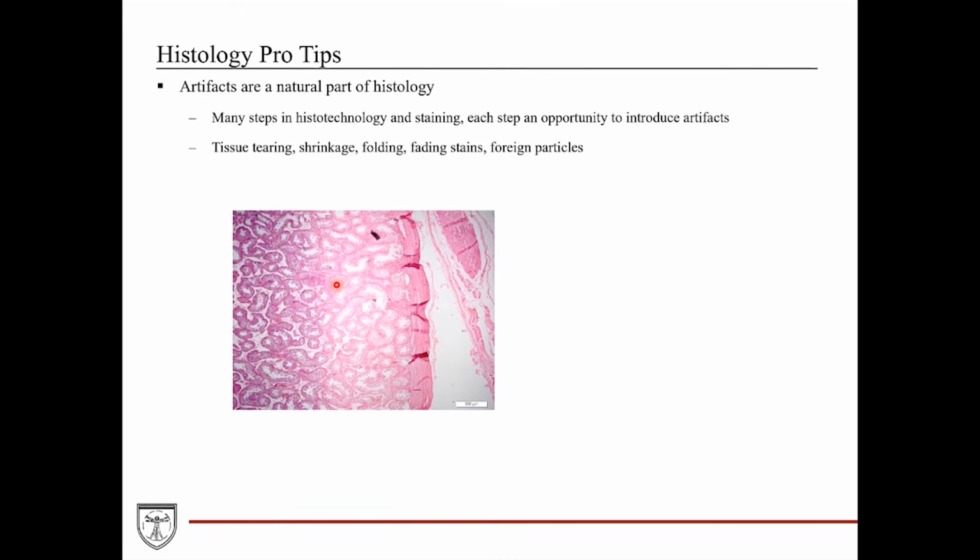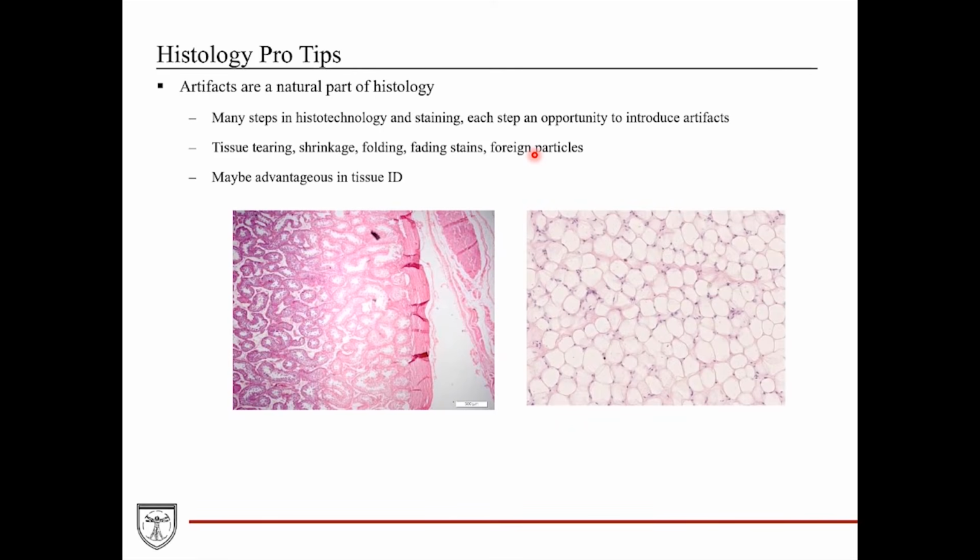And sometimes we can actually add some foreign particles that don't belong to the tissue, probably a dust particle or even a particle from a paper towel or something can get included in one of these tissue slides. Sometimes artifacts are useful in identifying some tissues.